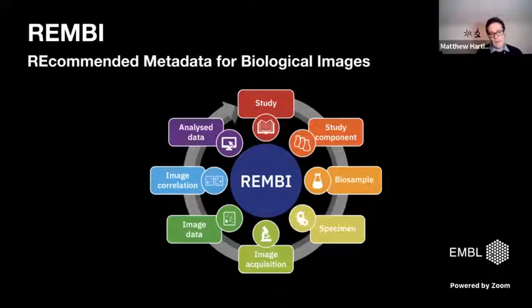So I mentioned metadata several times. Metadata in bioimaging is quite complicated, and it's complicated again because bioimaging is so diverse, because it covers lots and lots of different related techniques, which can be very different indeed. So for example, many techniques involve having a camera to capture photons or potentially to capture electrons, but some don't. Atomic force microscopy, for example. So that means that a general metadata standard that said, please specify what camera you had, wouldn't make sense.